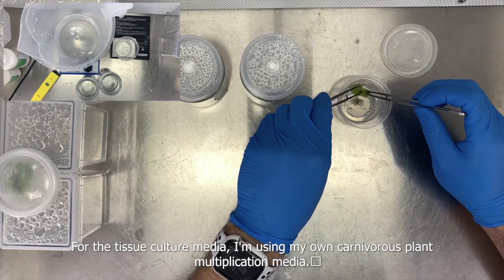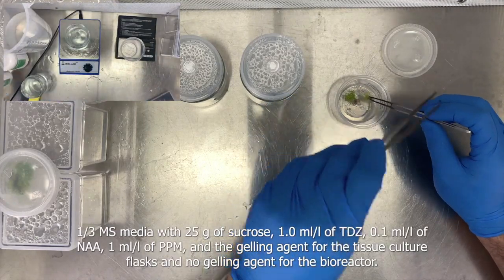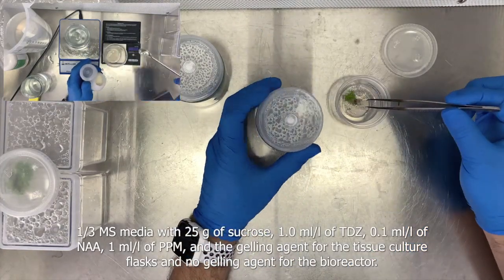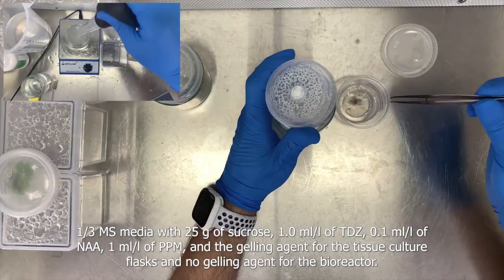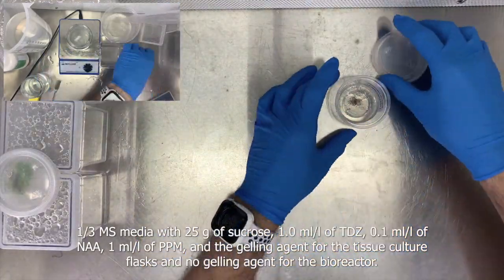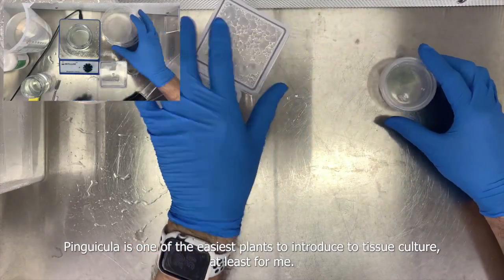For the tissue culture media, I'm using my own carnivorous plant multiplication media: 1/3 MS media with 25 grams of sucrose, 1 ml per liter of TDZ, 0.1 ml per liter of NAA, 1 ml per liter of PPM, and the gelling agent for the tissue culture flasks and no gelling agent for the bioreactor.